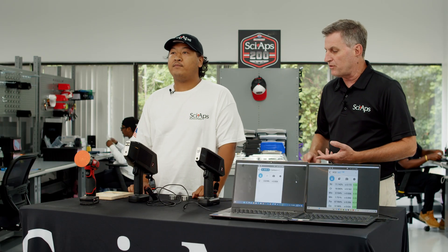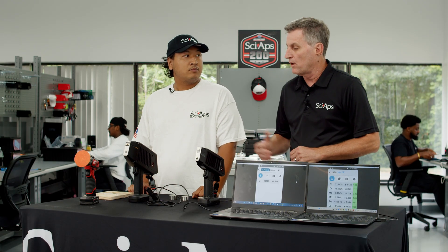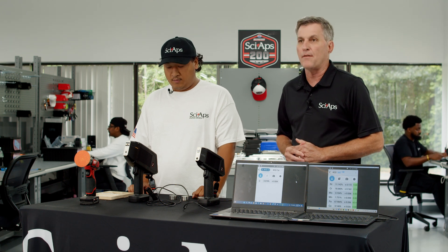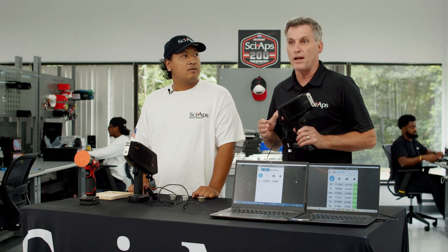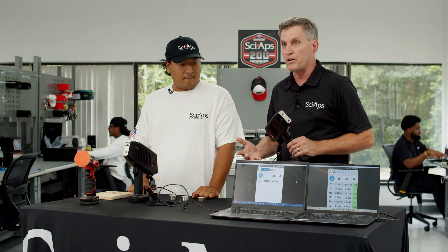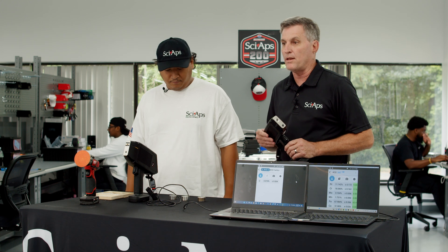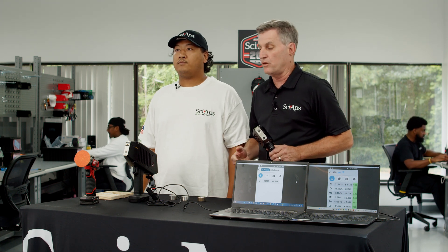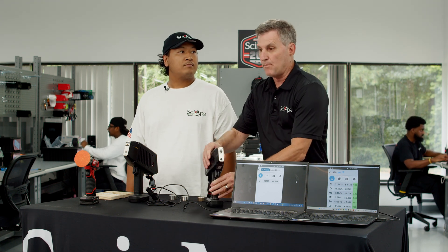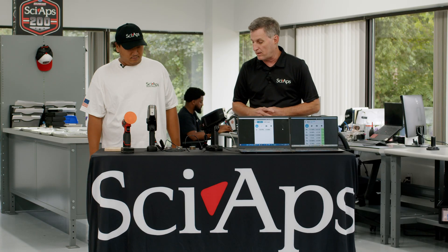We'll be looking at different stainless steels. You'll be able to do low alloy steels and then grade those materials based on the carbon content afterwards. Typically your X550, or your XRF, is used as a workhorse instrument — it's the instrument that you do all your identification with. You're looking at your major elements with it, and then on those occasions that you need to grade that material, whether it's an L or H grade, you're able to use the CSI, and we're going to demonstrate that today.